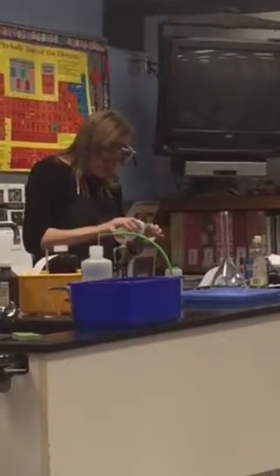What do you know about particle size and reaction rate? Smaller particles mean faster reaction. So I could dump in this solid, but it still wouldn't be as fast as if I make a solution of it first. So I'm going to add a little distilled water and try to make a saturated solution here.